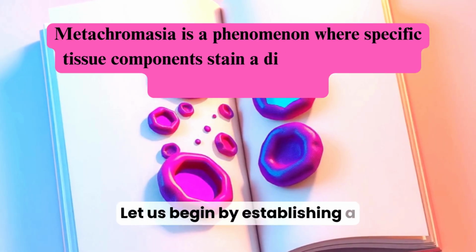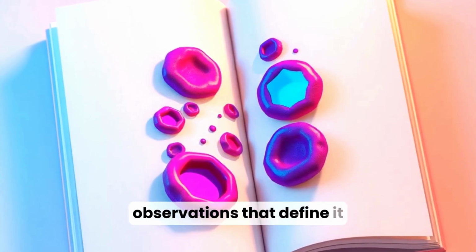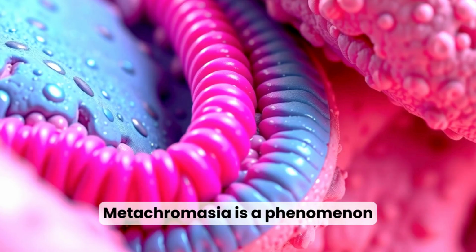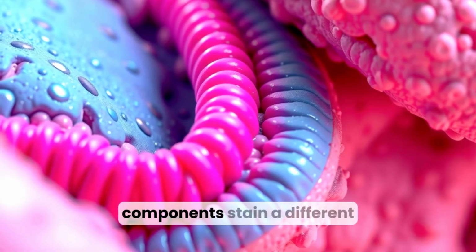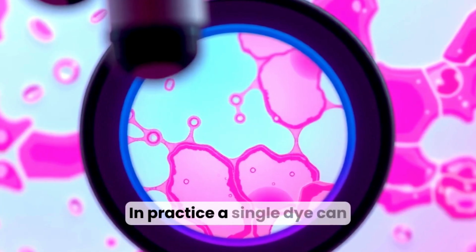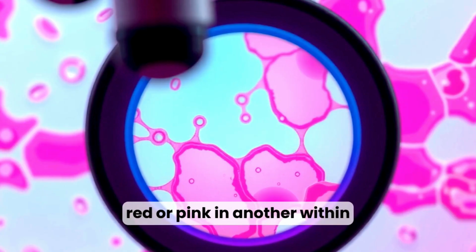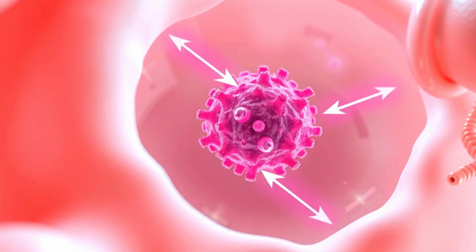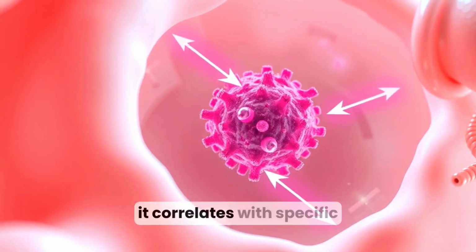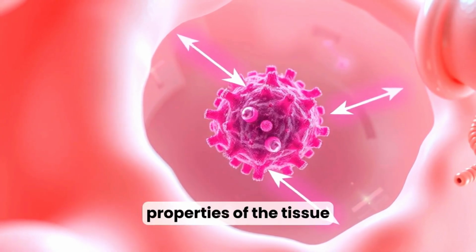Let us begin by establishing a precise definition of metachromasia and the basic observations that define it. Metachromasia is a phenomenon where specific tissue components stain a different color than the dye's native color. In practice, a single dye can appear blue in one area and red or pink in another within the same specimen. This color shift is not random. It correlates with specific biochemical and structural properties of the tissue.